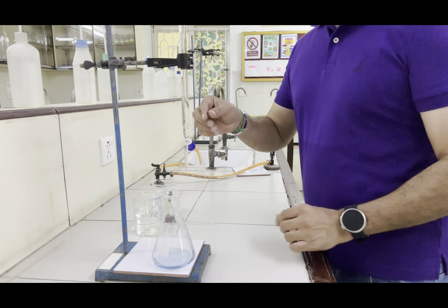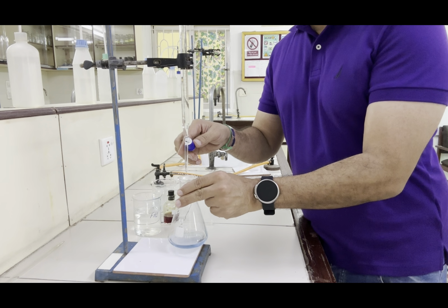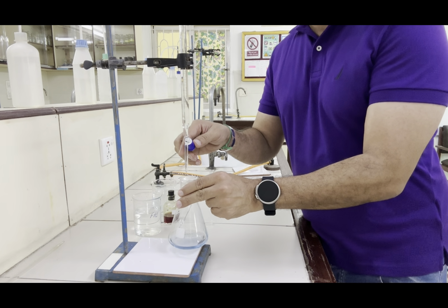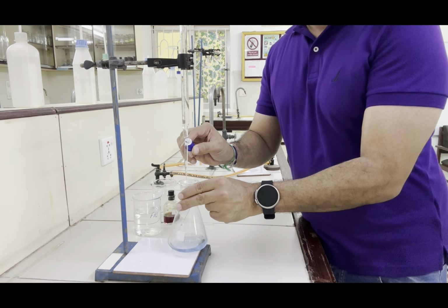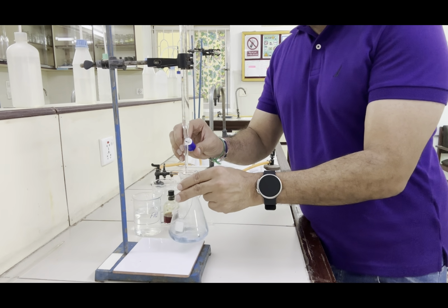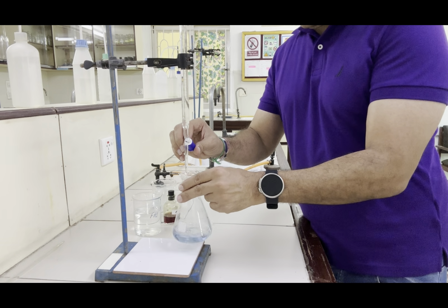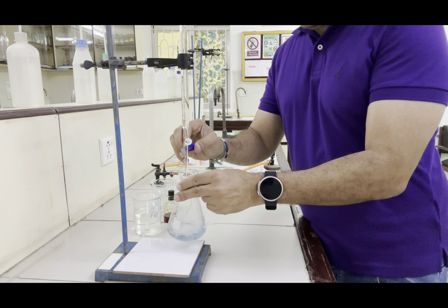Now we will start adding Fa1 solution from the burette by opening this tap and continuously swirl this, and look for the solution as soon as it turns yellow, which can easily be seen over the white tile. We will stop.